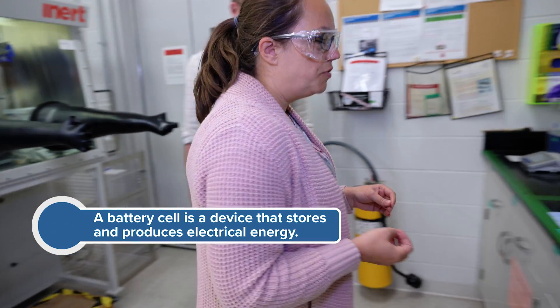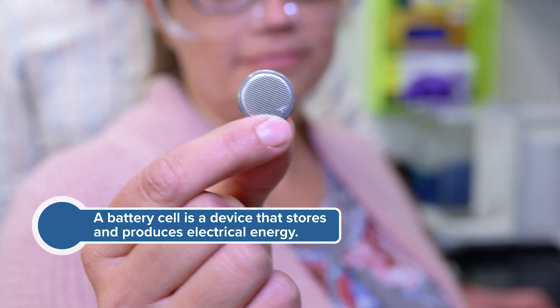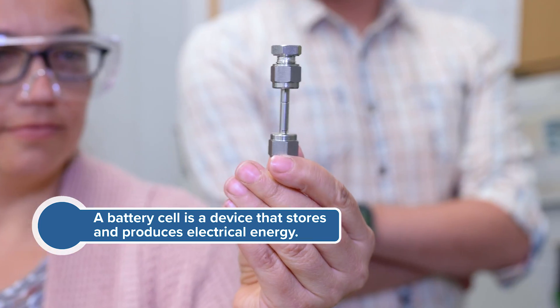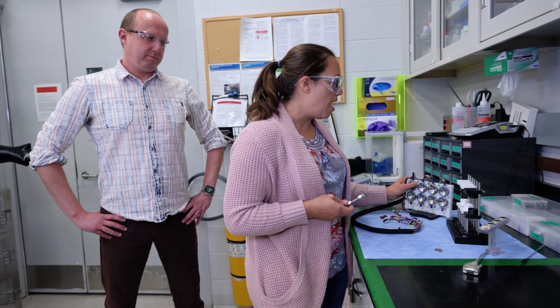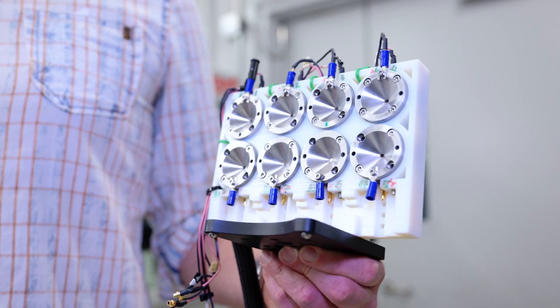Among the cells that researchers are studying, they could be as simple as coin cells, they might be some vertical cells, or our custom designed pouch cells.